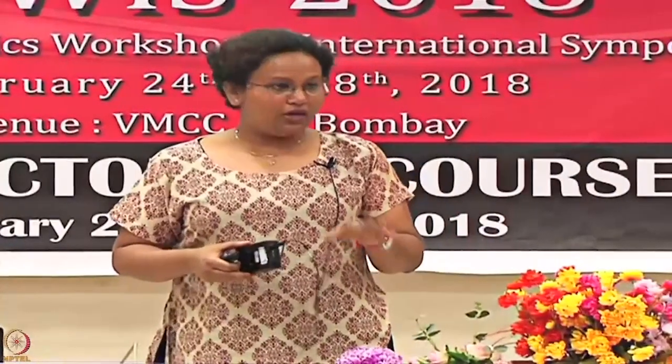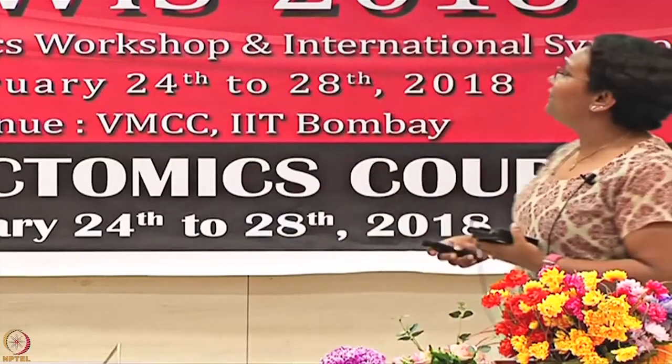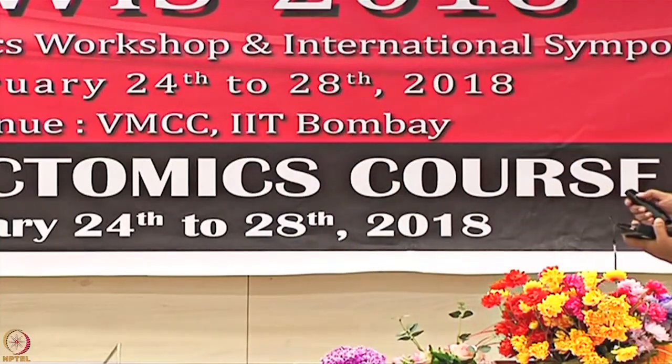Purity. The most pure one should go as a ligand. You cannot have an impure ligand. The more junk you immobilize, the dirtier the data becomes. You can still use an impure molecule as an analyte, but that is only limited to applications like binding experiments. If you have to do kinetics, you cannot afford to have an impure analyte. But if you're doing a concentration analysis or a binding experiment, it's fine to have a slightly impure analyte.